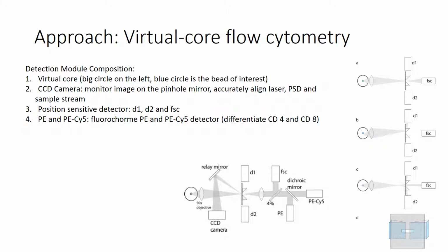So this research introduced a method to address the problem. Instead of using sheath liquid to position the particles with respect to the focused laser beam, it used a confocal microscopy to take a closer look at the area of interest. The setup of the system can be shown in the diagram down below.